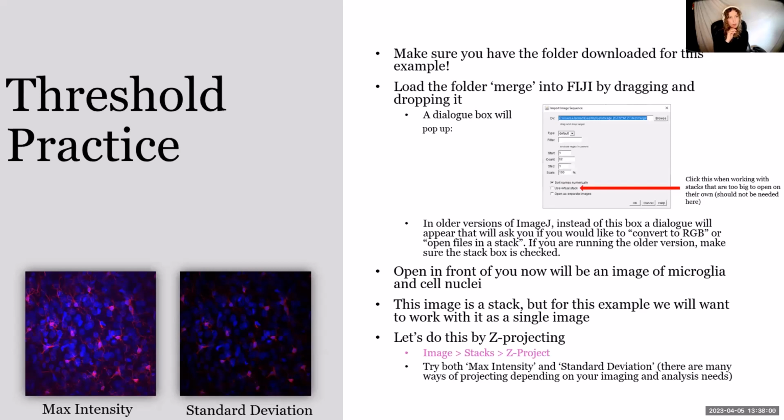Okay, people on the 2021 MacBooks, you definitely should have no trouble, these should not be hard files to open. Okay, some people are getting it working. Oh yeah, you definitely have to make sure that you've decompressed and extracted the files to your desktop and aren't trying to drag and drop the zipped folder into Fiji. That won't work.